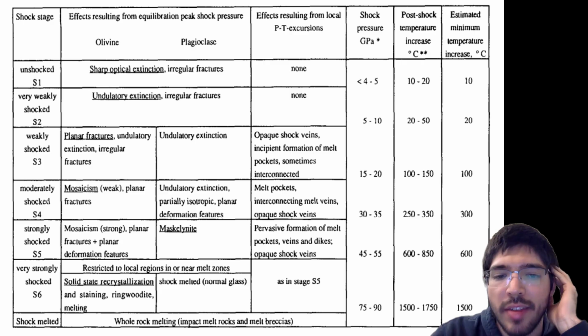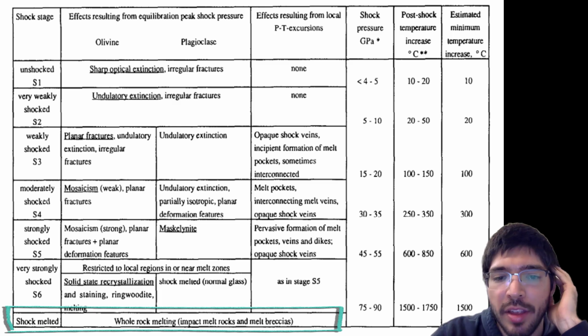The best way to see this is using the petrographic microscope. You'll tend to see blue or green olivines in plain polarized light. I didn't see that when I was looking at the sample, so we don't appear to have this phase.